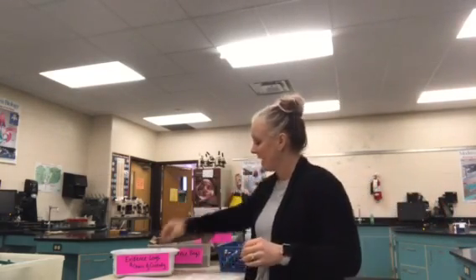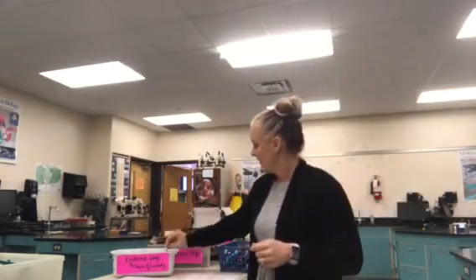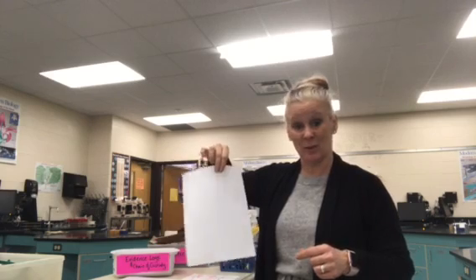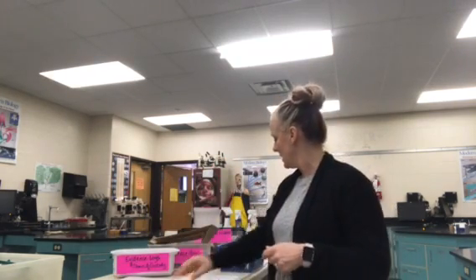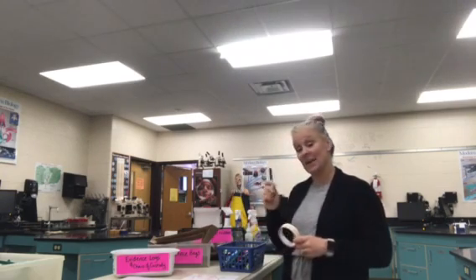You're going to need an evidence log. So the evidence logs look like this. And in a little bit, I'm going to show you how to fill that out. You're going to need a piece of paper. This is just recycled paper, so there's random stuff on the other side. Ignore that. We're using it recycled. We're going to use this to bindle up our evidence. So I'm going to show you how to make a paper bindle. And then you're going to need some masking tape and a marker.